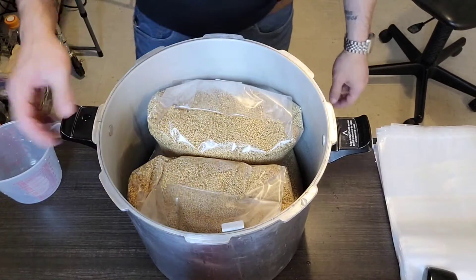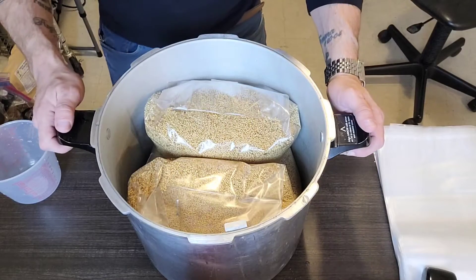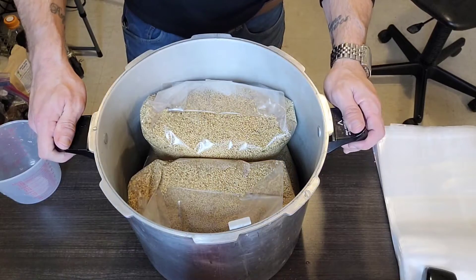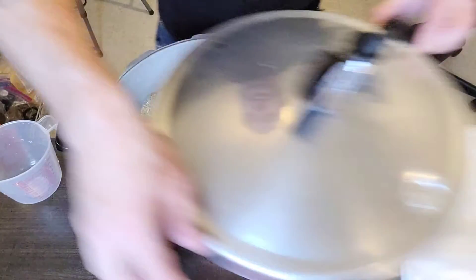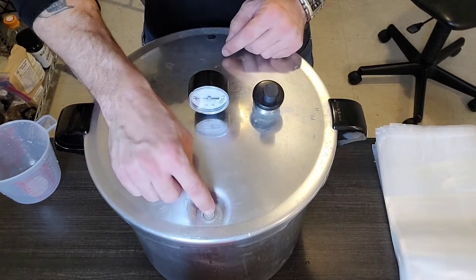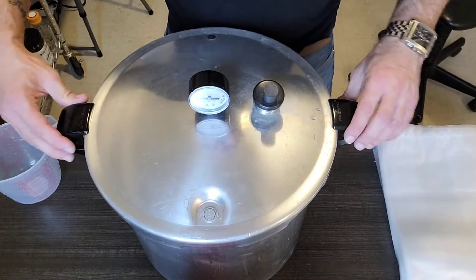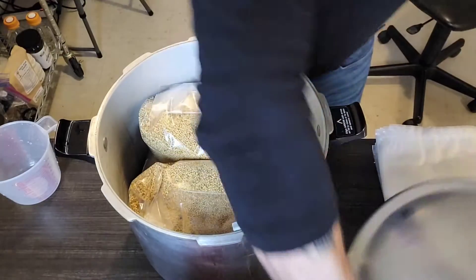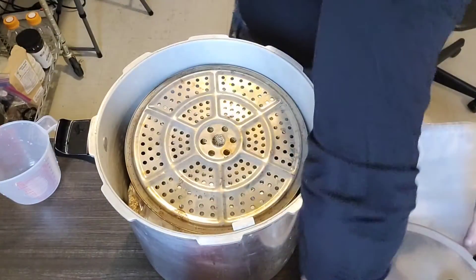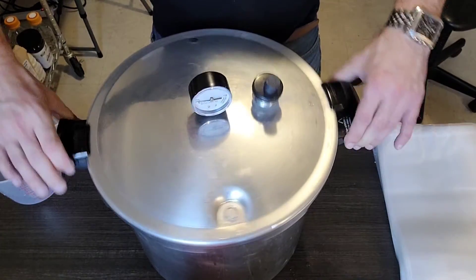Now you can see there's a lot of extra space in here. You could probably fit two more bags, but to keep the valve and the lid lock free, you're probably best off not jamming it full of bags. Add a trivet to the top and close it up.